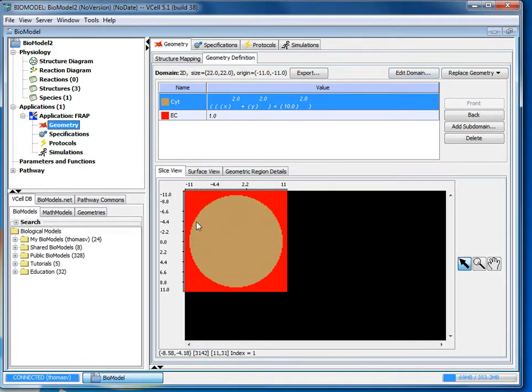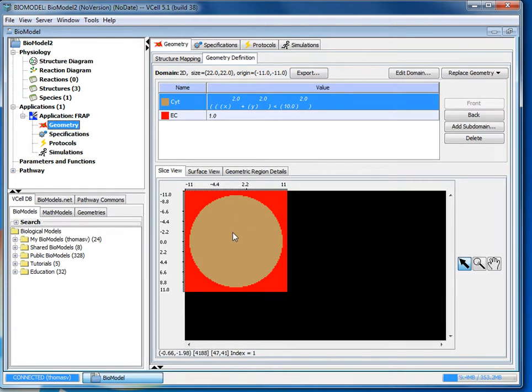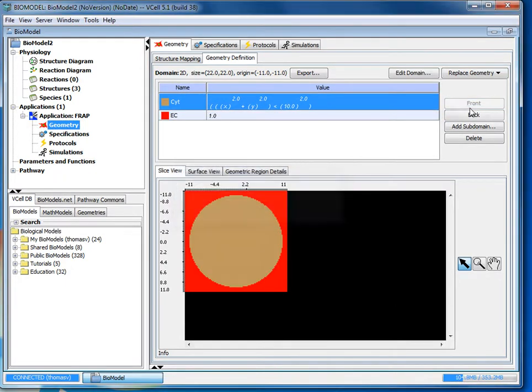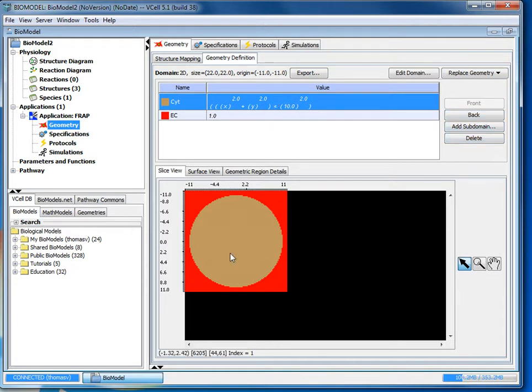Your geometry should look like this. If you can't see the circle, have the site subdomain selected here in blue and click on bring to front. And you can do this to organize your subdomains so you can see them all.